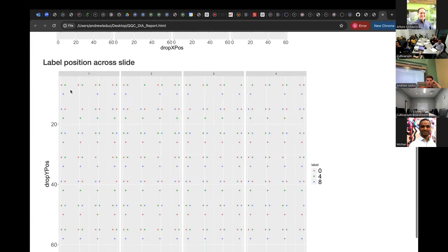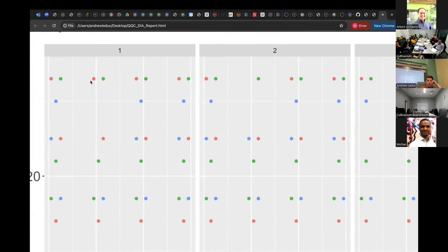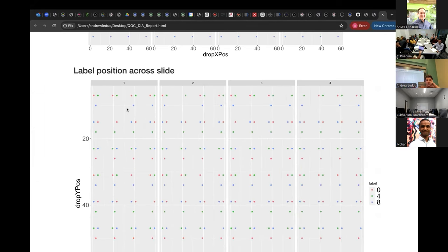We can also look at the labeling scheme if we wanted. Now you'll notice what's going on here. There's only two, and so this one is going to be a negative control. We just didn't dispense a cell there, because we actually did dispense the label and the trypsin. For label-free workflows, you just don't dispense a cell and we're probably not going to get any intensity. But for these multiplex workflows, it's an additional component that you want to be careful of, and check that the signal you're getting is not super noisy, and not just integrating the noise here.